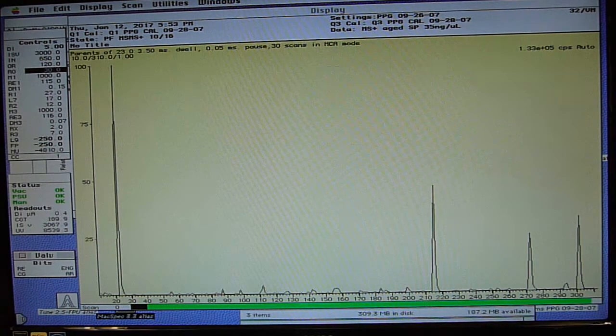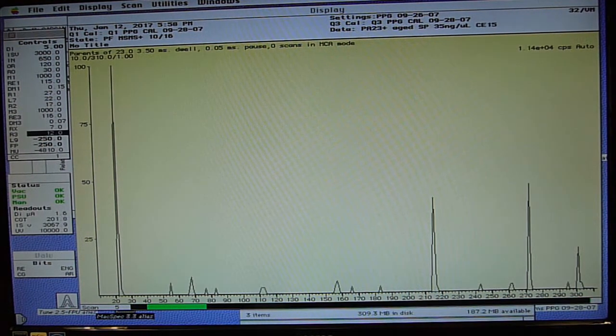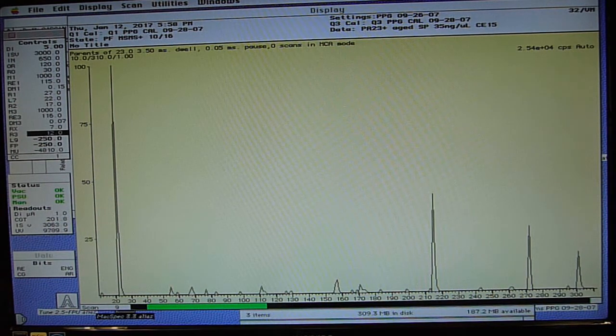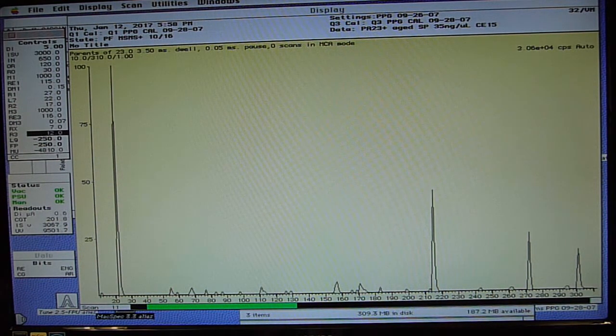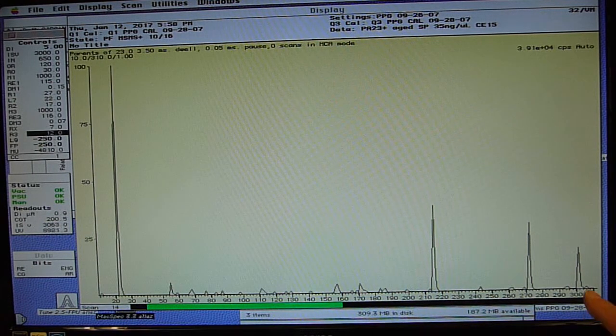So let's save this data. And let's try some lower energy. This is with a collision energy of 10 eV. So you can see at 23, at 215, 272, 308.